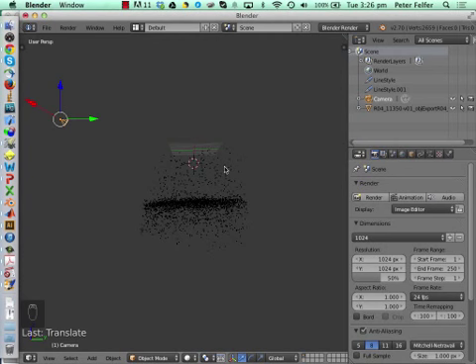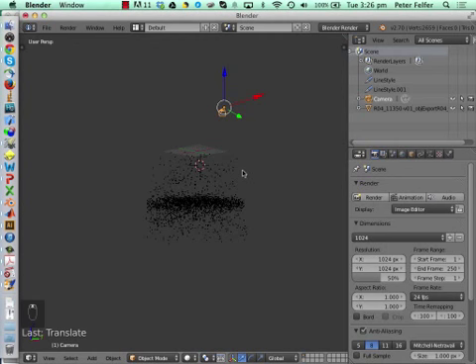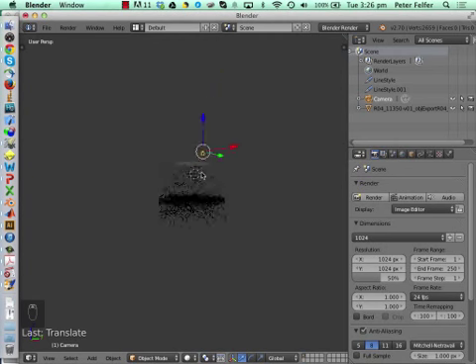You can also have multiple cameras in your scene, and that helps you if you want to have multiple perspectives, but you don't want to move your camera, because usually you always want to keep your file in a way that you can always repeat a render. You create a render, you write your paper, and then you think, okay, I want a different color, I want a different this, I want a different that. I can easily just go back and change whatever you want to change and re-render.